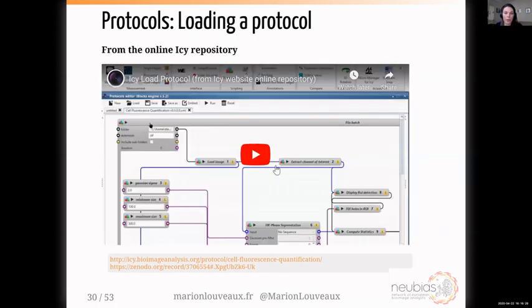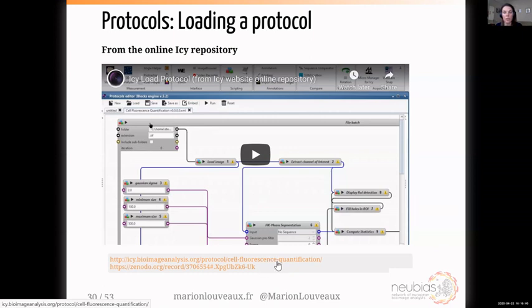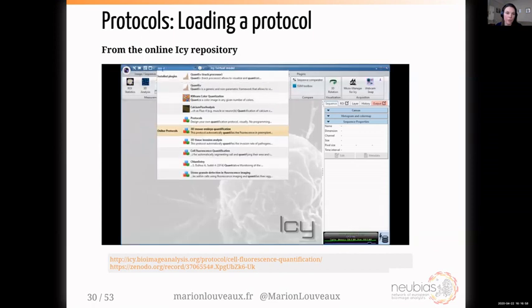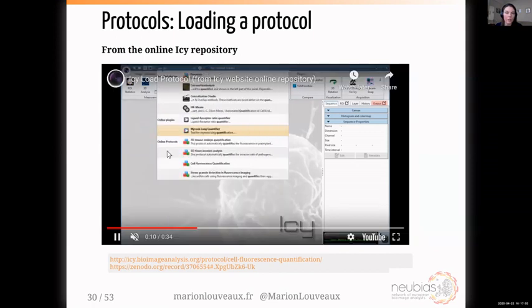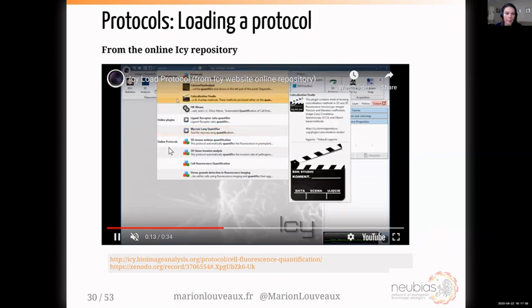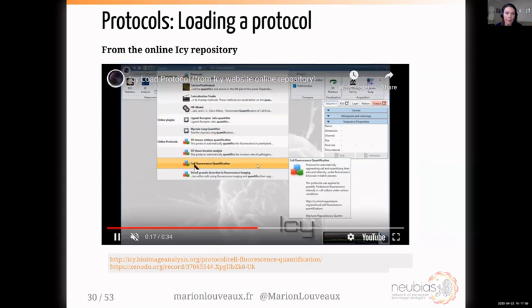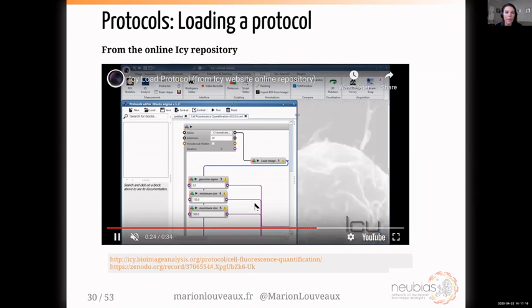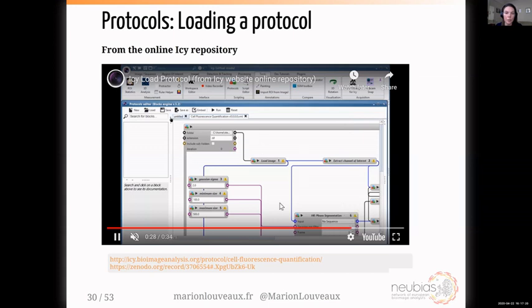I will first show you how to load an existing protocol. There are already more than 60 protocols on the ICY website. I advise you to look at them because they can give you ideas on how to get started. The easiest way is to go through the search bar and type the name of the protocol or some keywords. The one we are interested in is called 'cell fluorescence quantification.' If you click on it, it will open the protocols plugin and automatically display the protocol.